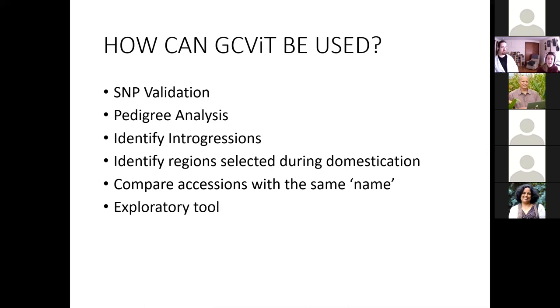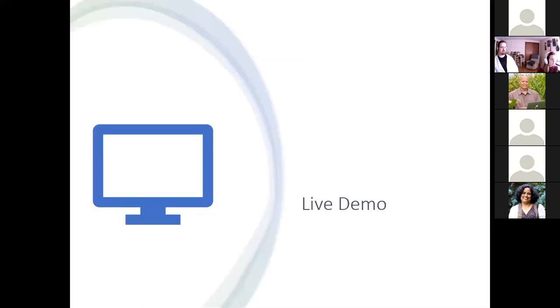As an exploratory tool, if you have a few lines of interest and want to compare them to a reference, you can identify any regions that stand out. For example, if you have five lines sharing a certain phenotypic trait, you can compare those to a line lacking that trait to find genomic regions that differ between all five lines and the reference.